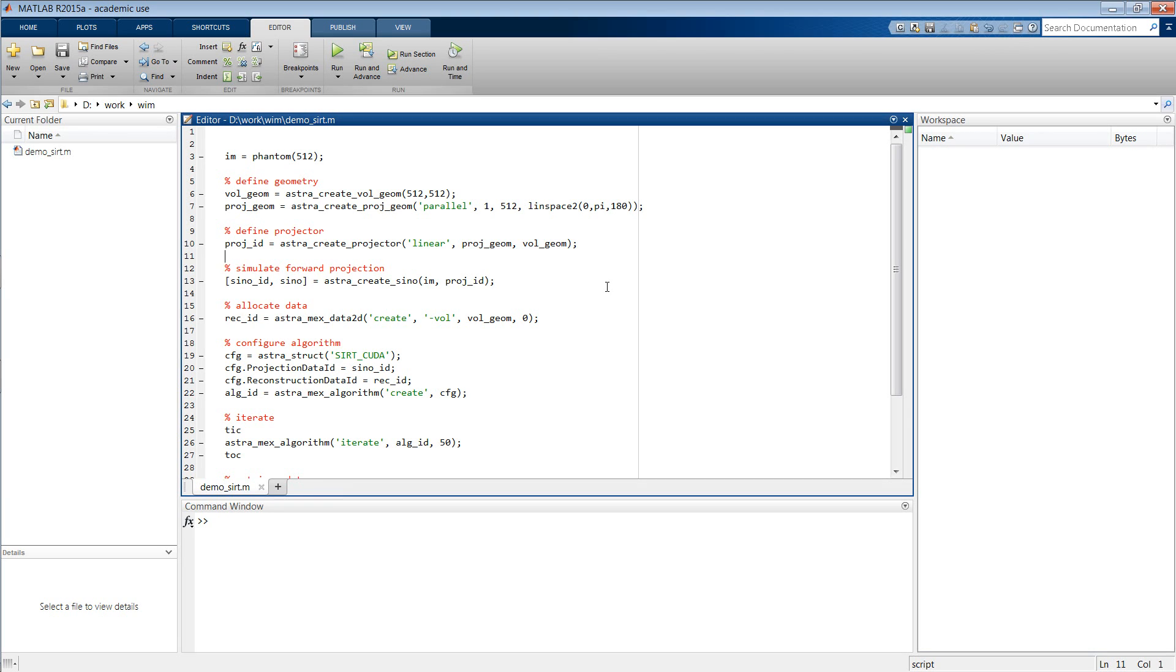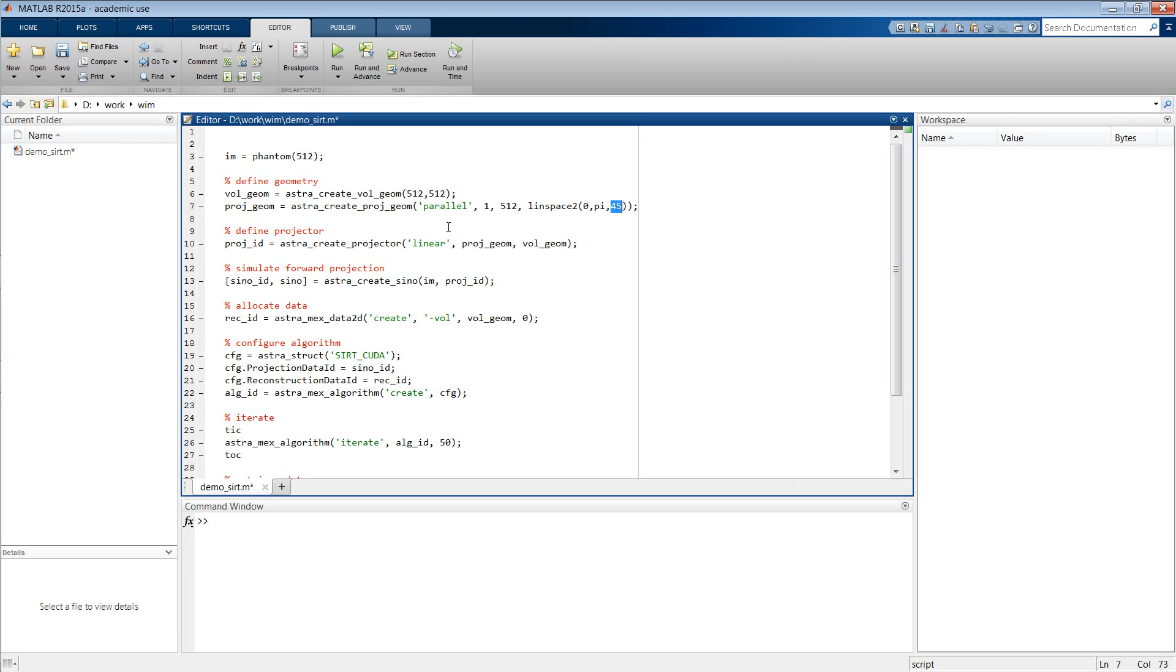The addition of a minimum constraint in the ASTRA Toolbox is incredibly easy. Let us first create a reconstruction with the SIRT algorithm of a Shepp-Logan phantom image with 45 projection angles without a minimum constraint.